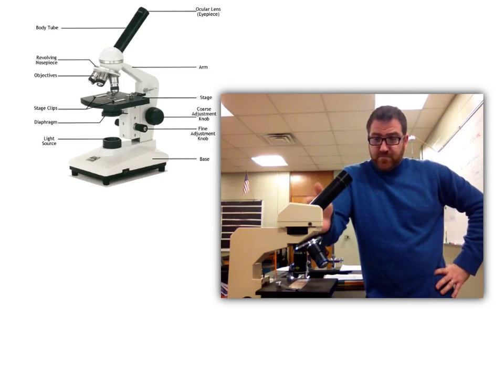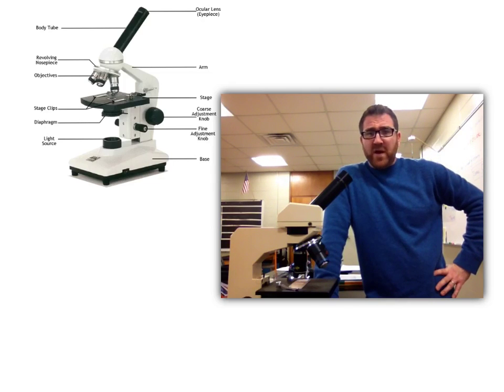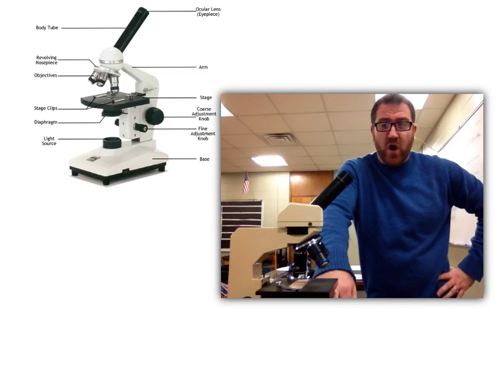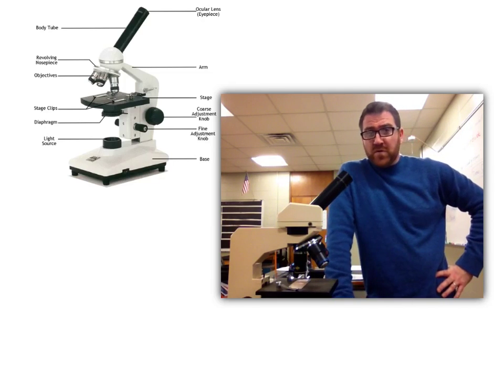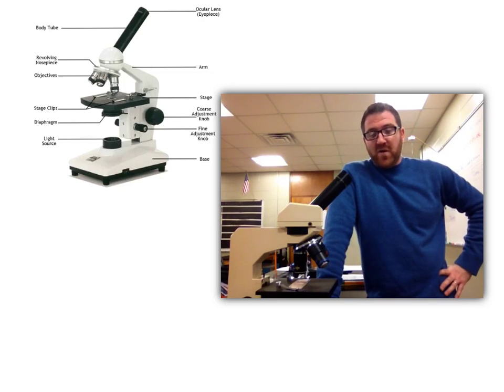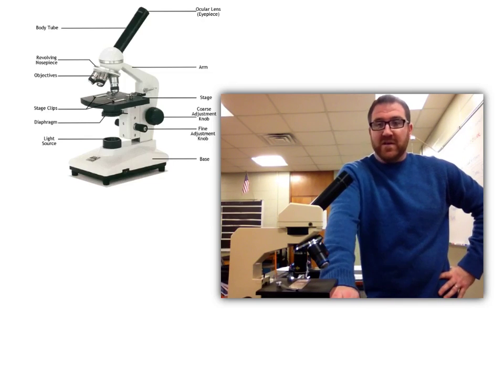So when you're finished using the microscope and finished analyzing whatever it is you're looking at, please turn off the lamp so that we don't burn the bulbs out. The bulbs can be relatively difficult to replace.